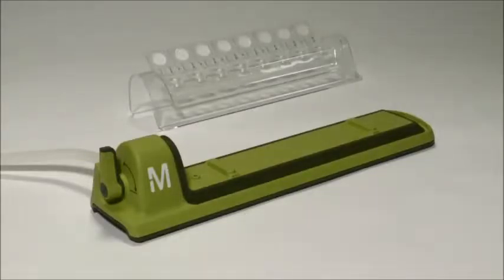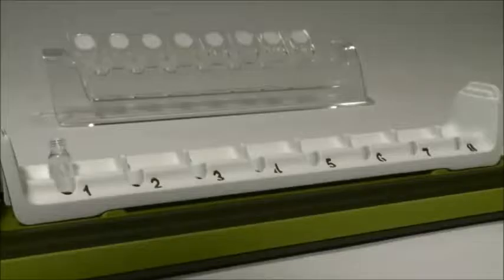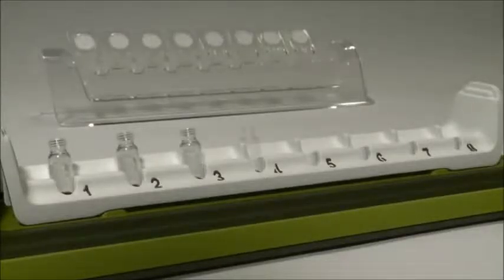Once the vial tray has been placed into the base of the unit, you can load your vials. The system can accommodate most standard 12 by 32 millimeter HPLC vials.